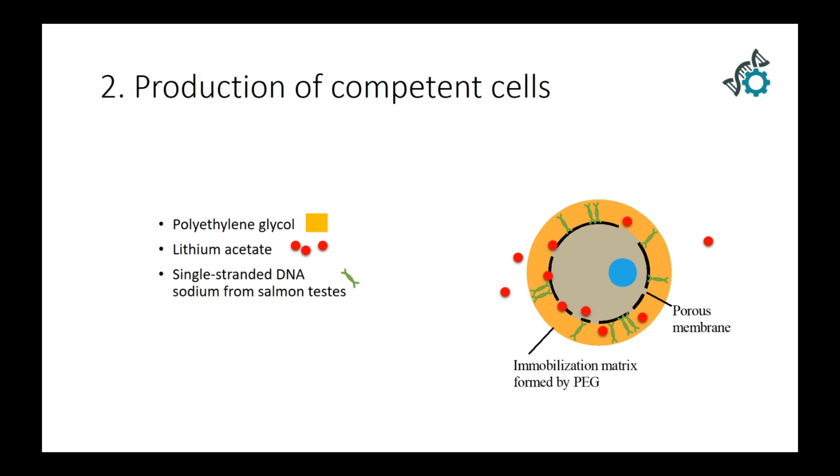The last ingredient we add is single-stranded DNA from salmon testes. And whoever came up with this idea to add this particular chemical, I have no clue. But this is how it works. You see, DNA wants to make interactions with cell membranes. That's just how it is.